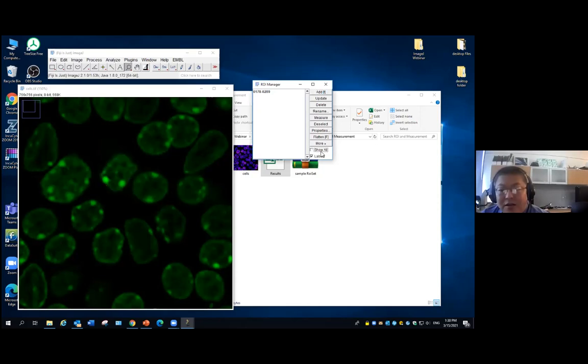Now you can see, if it didn't show, I click on this, then it shows on here. So the good thing for the ROI Manager is now you can add more cells in it. So I will say I want to add this cell. I began to draw it.